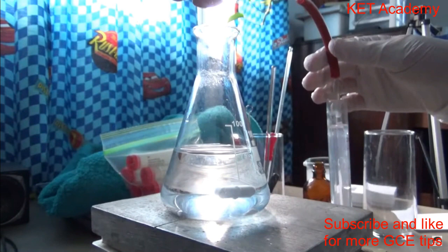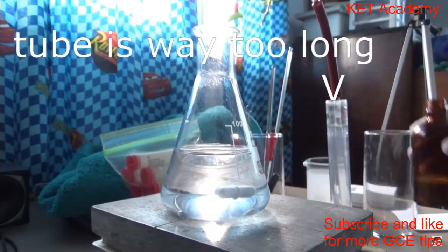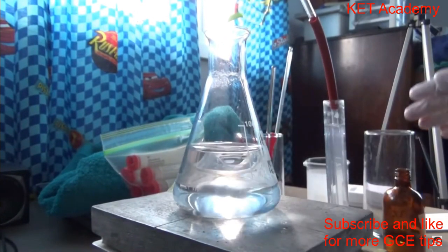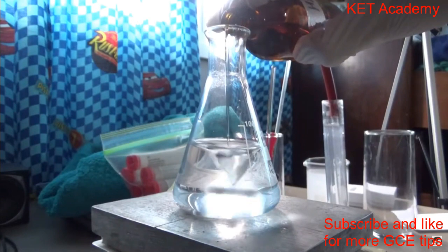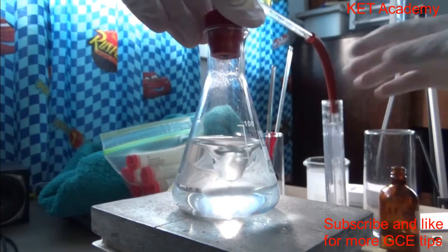What I'll do is I will now pour the acid in here. Actually, I'll get that stirring again. In the middle. Pour the acid in, just like so, and cap. Just like so.